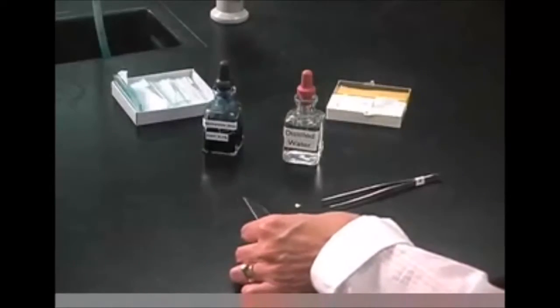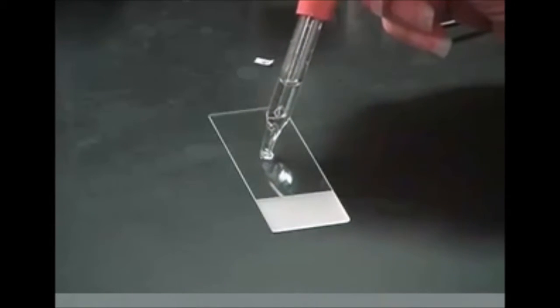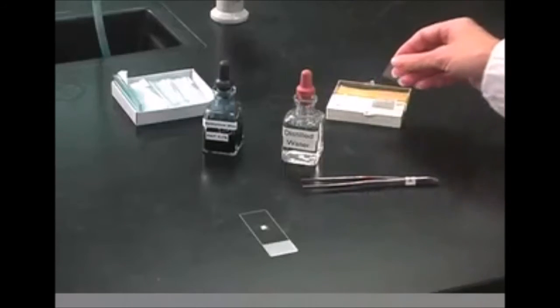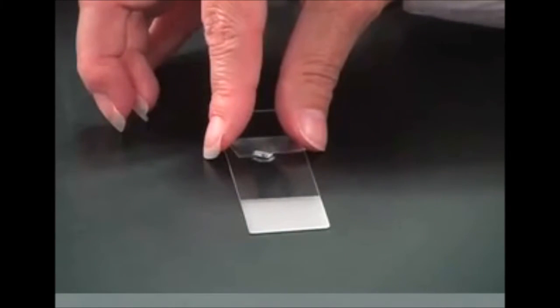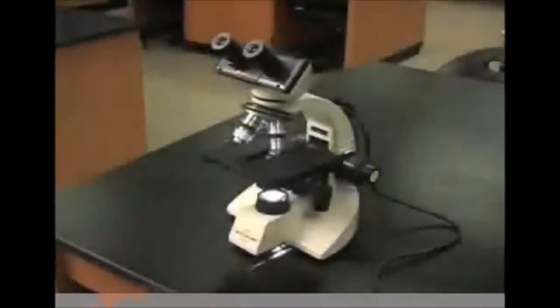To make a wet mount, a drop of water or other specified liquid is placed in the center of the slide. The item to be viewed is added and mixed within the drop. The coverslip is positioned at a 45-degree angle near the drop, moved slowly to the edge of the drop, then gently lowered over it. Look for bubbles and if present, gently tap the coverslip to disperse them.